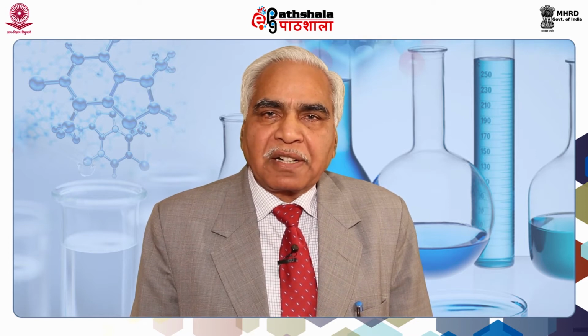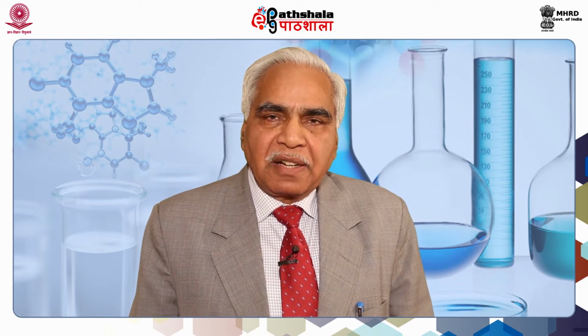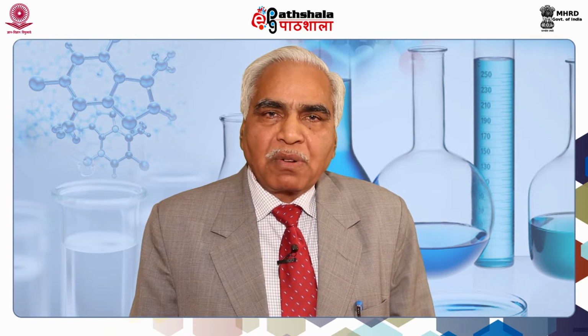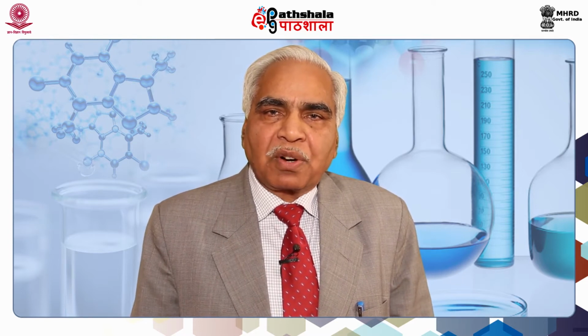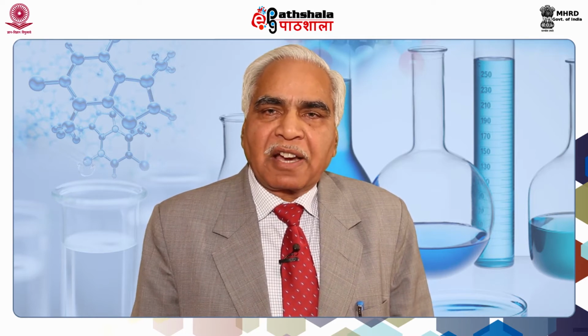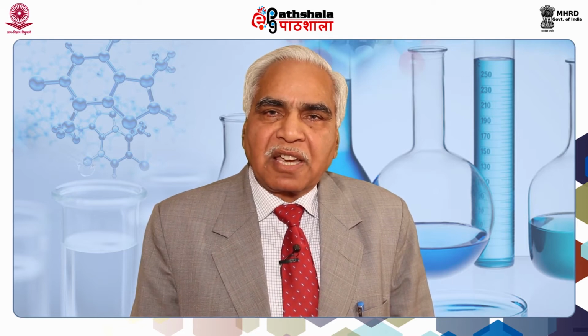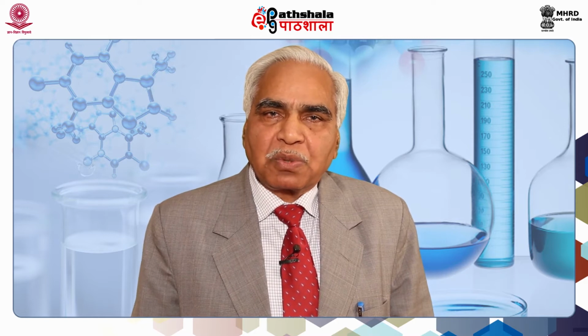Other biochemical techniques can be used for identification as well as quantification of protein molecules. Amongst them, we see the electrophoretic techniques, which are largely used for the identification of the molecules in some situations, like agar-gel electrophoresis and SDS-based electrophoresis. These can at times be used for the separation of the molecules for subsequent use.